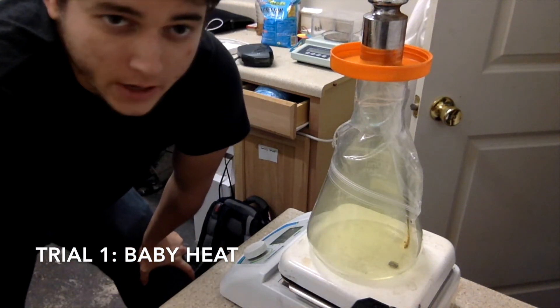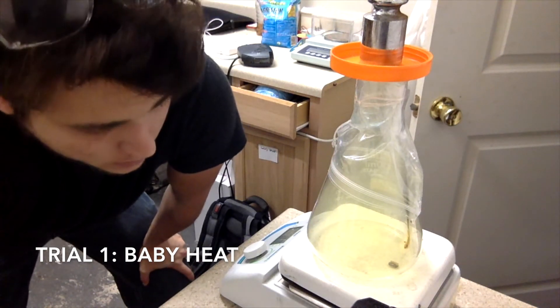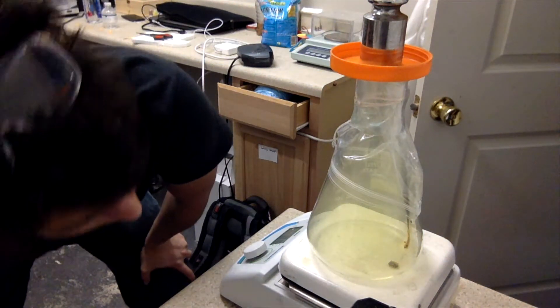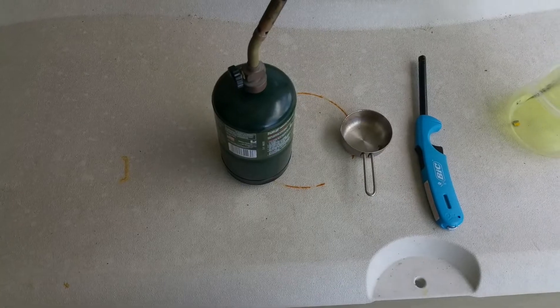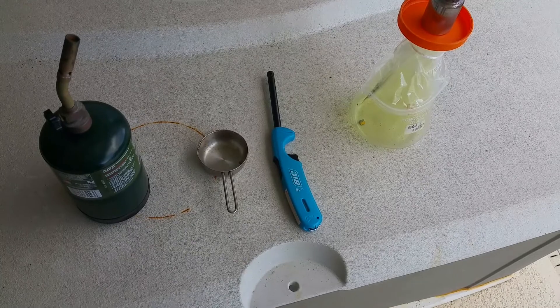I kind of sadly expected that outcome. I was hoping for a little something — some gold chloride dust in the air — but I don't have much of anything going on right now. I think a better idea is to use propane to heat the gold; it'll get it much hotter. So I'm going to try that out.